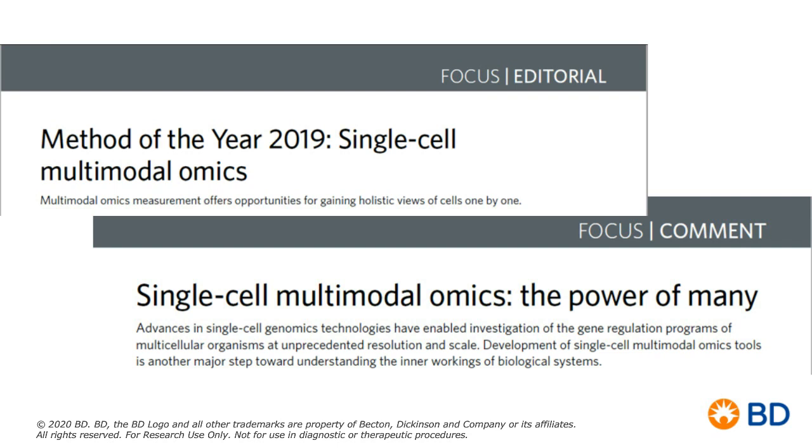The scanner, I feel, has a lot of value in the fact that it provides quite a bit of upfront QC metrics that can evaluate the process as you're progressing through the preparation. It provides some QC metrics that essentially let you know whether or not the assay is progressing well enough to proceed through library preparation and ultimately go on to sequencing.